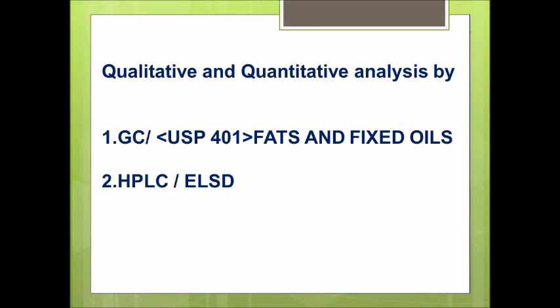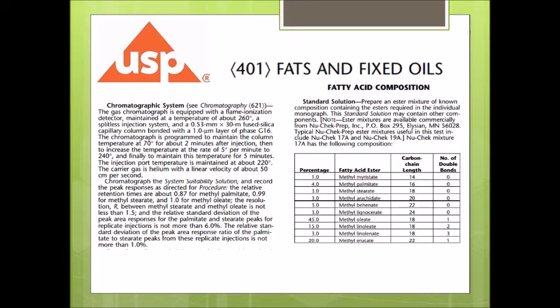The methods that I'm going to talk about are GC with USP 401, which goes on the fats and the oils, and the second one is HPLC with ELSD. My method of choice, I would say, is the GC method. So let me start by talking about the GC.